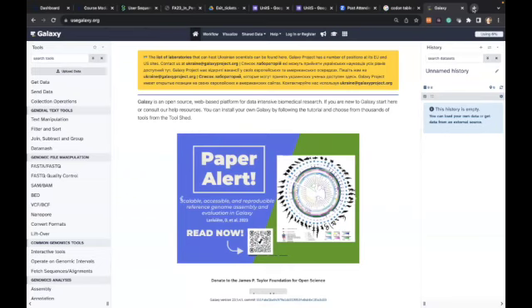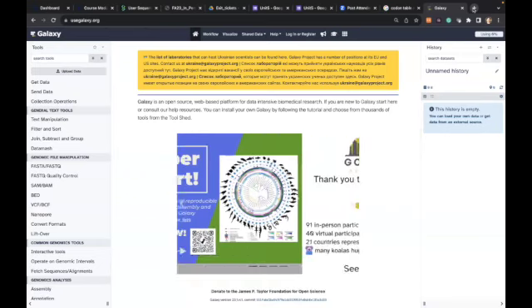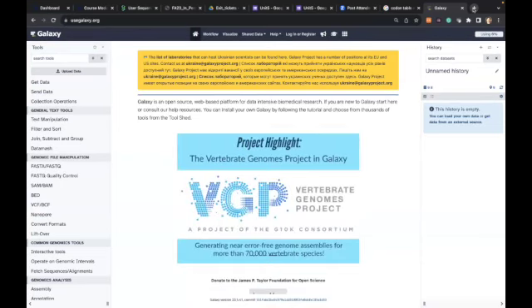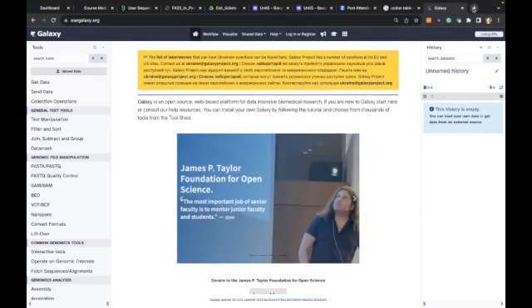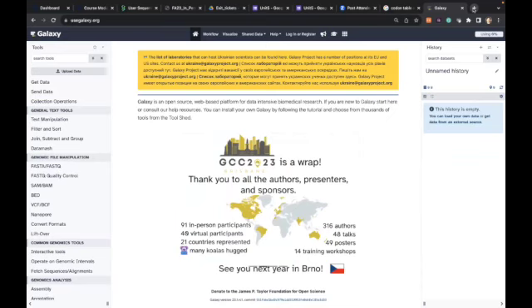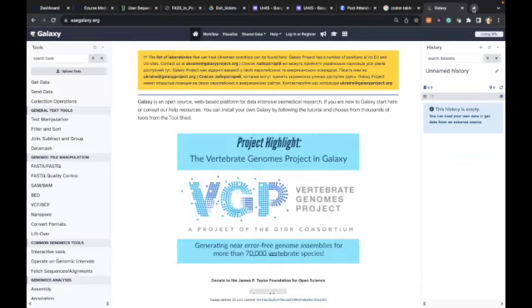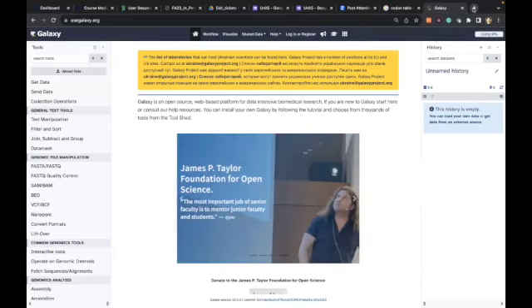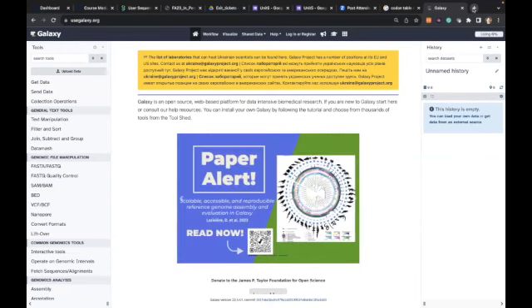And in genomics, a lot of software is written for Linux, not really for Microsoft Windows or Mac OS, so a graphical user interface is not available. So in most cases we have two options: use Galaxy or use the command line.